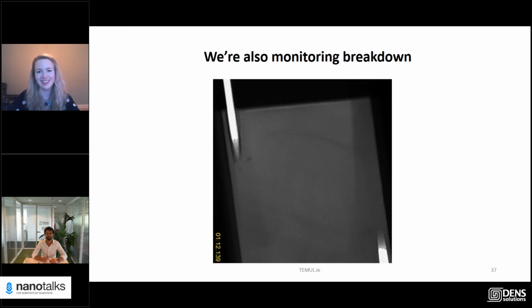Cool. See, I'm learning as well. Since you have a really cool FIB, probably you also have TEOS. TEOS is not very conductive, so instead of using platinum, if you just want to weld your lamella to the chip, you can use TEOS. Okay, ooh. Yeah, I'm going to talk to you before or after this. Sure.